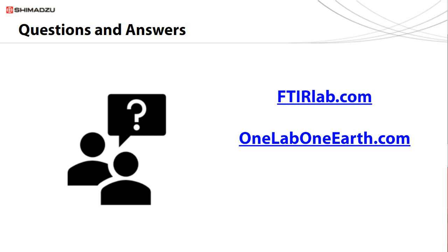Next question is for Sudhir. Although I have not used an infrared microscope as a lab person in a water analysis lab, my understanding is that the higher-end FTIR microscopes to look at micron-sized particles are expensive. Are there lower-cost alternatives? And if yes, what are the limitations?